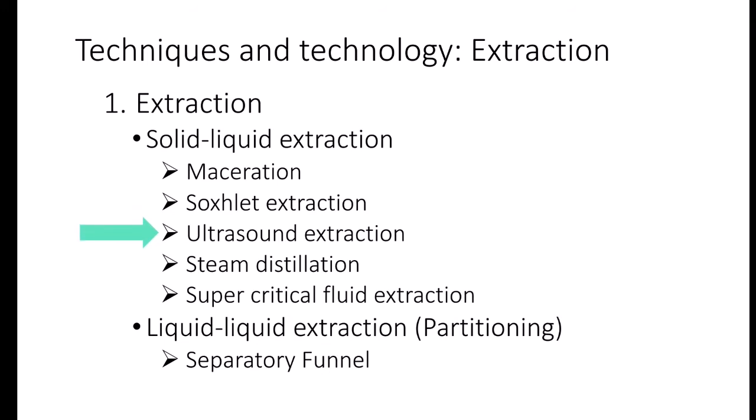Next is ultrasound extraction. Instead of physically agitating the solid particles to aid in the extraction process, ultrasound waves are used. The instrument used for this one is called a sonicator. We won't be going into detail in this one, but it might be interesting to know this. That's why I included it in the list.